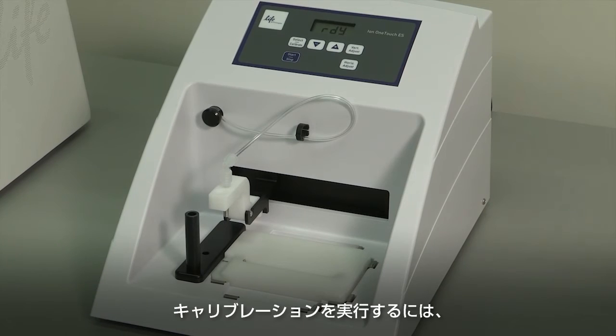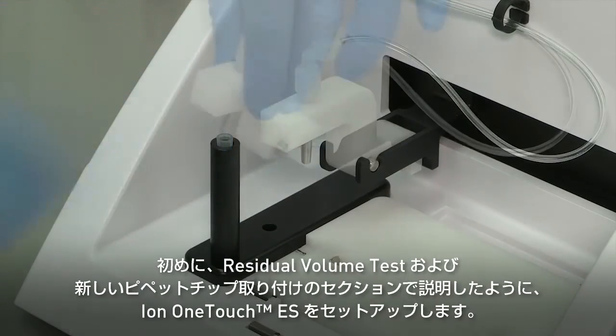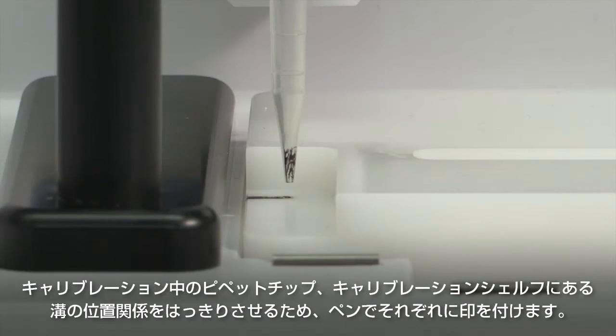There are matching serial numbers on the tray assembly, tip arm, and the Ion OneTouch ES. To perform the calibration, first set up the Ion OneTouch ES as previously described in the residual volume test and install a new pipette tip. To clearly see the relationship between the pipette tip, calibration shelf, and notch during calibration, mark each of them with a felt-tip pen.